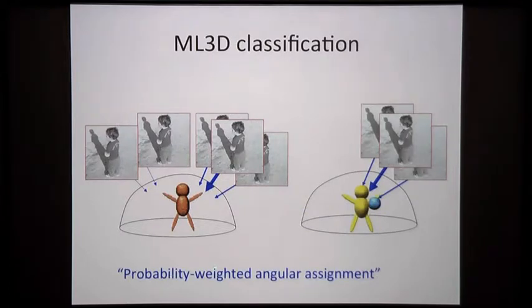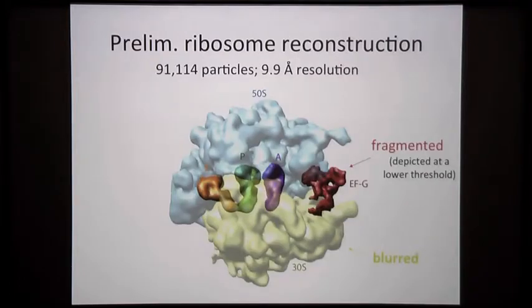And as I said, again, with maximum likelihood, every particle gets spread out over all the orientations, but also over all the references, in this case both references. Now, if you know that the complex has something in its hand, well, already knowing it has a hand without a priori is difficult, and that was Paula's methods for initial models. But if there's structural heterogeneity, actually knowing what kind of heterogeneity is there is very, very difficult.